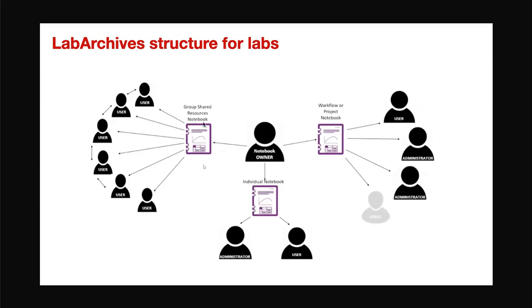So say in this shared notebook, you put the lab protocols, you can put where all the reagents are, you can put the material safety data sheets, you can put how to make the reagents, the formulas for reagents, where all the reagents are in the lab, in the freezer and everything. And then you can have also another notebook, if two or three people collaborate on a project, specifically for the project and share it with other people.